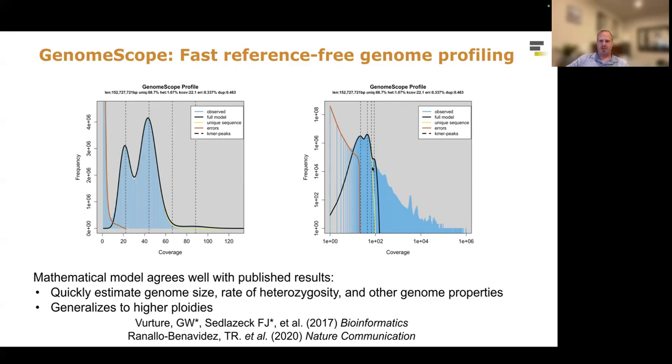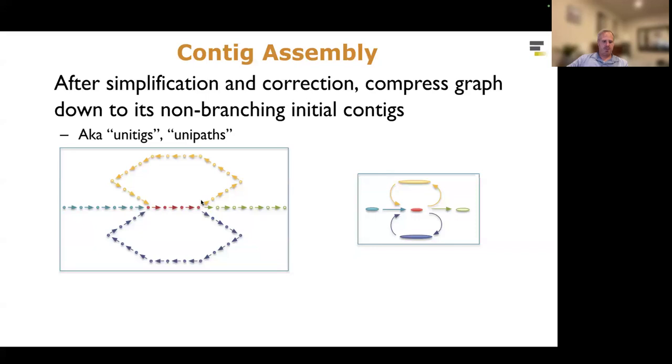So as simple as this k-mer analysis is, you can learn a lot about the genome size, repeat content, heterozygosity, and error rate. Lots of different properties can immediately be read out using this GenomeScope algorithm that fits this statistical model. So when you assemble a genome, we really recommend you do a bit of QC using GenomeScope. There are some other metrics, like FastQC, to analyze the quality values that are present there.